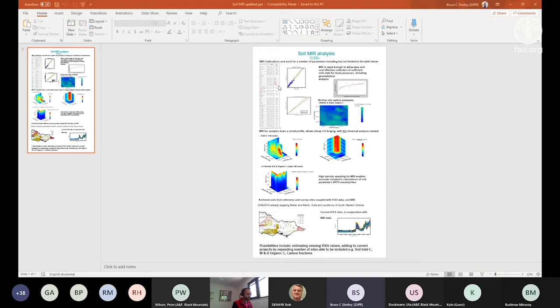As was pointed out with an earlier presentation, again, all the soil samples were analysed in the one lab, albeit over time. And one shouldn't assume that the one lab will produce comparable, reproducible data over time, because there are subtle variations on methods, even though the substantive method's the same, and that can be an issue.